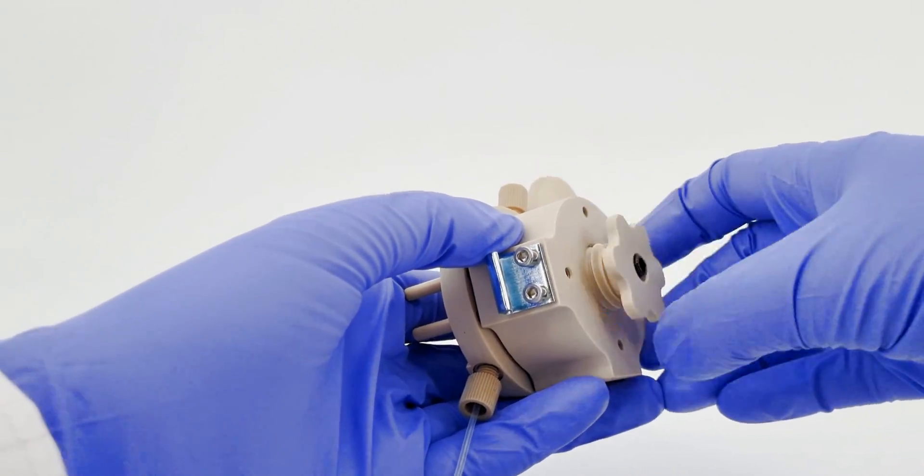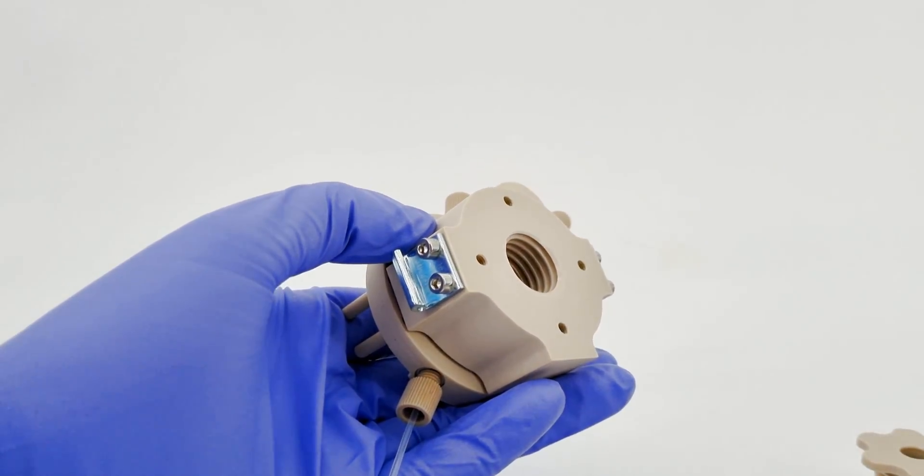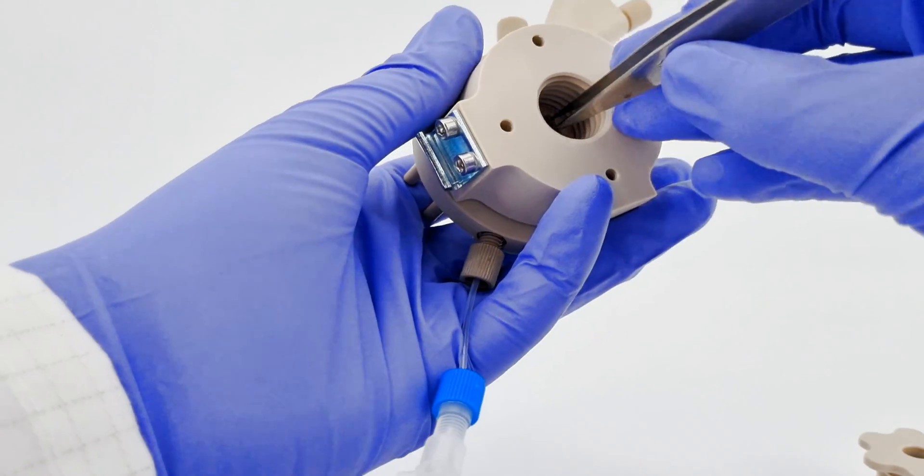Next, let's get those polarizing electrodes out. Unscrew the holder and remove the piston. And using your tweezers, take out the plate electrode.